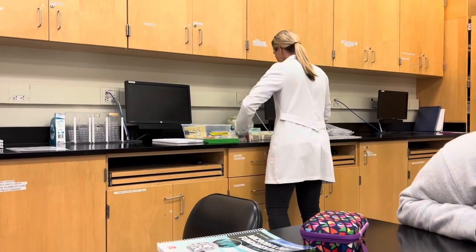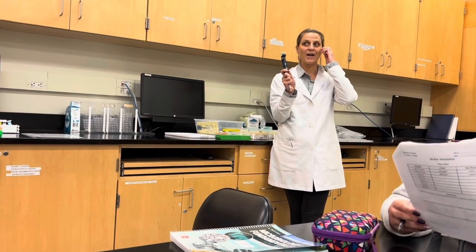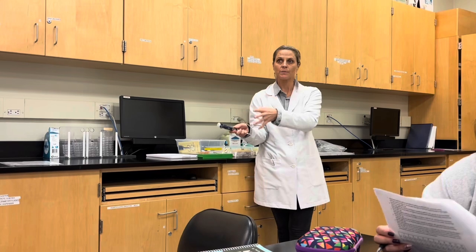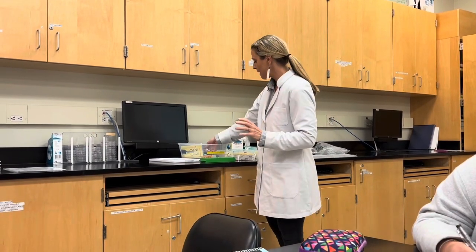Yeah, perfect. So you'll need pipette tips and a pipette. This is a great time to figure out your pipettes. What microliters are you looking at? Maybe convert that into milliliters and liters, and go back from liters to milliliters to microliters. And just do some practice. I know there are probably 3 questions about that on the lab practical final. I will be happy to go over this with you. Everybody struggles with it, so it's a good time to just practice.